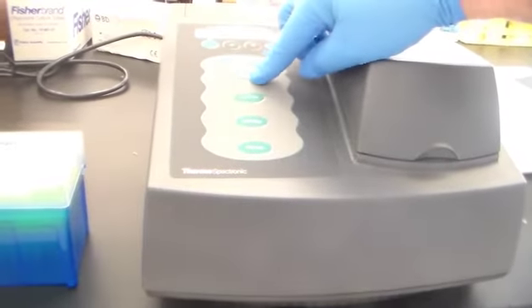So I put that blank in there, and I'm going to hit this button that says 0 absorbance, and it's going to set the machine to 0. You'll do this before you put in your sample. As soon as you get a reading that says at 600 nanometers you have a 0.000 absorbance, A stands for absorbance, you know the machine is blanked.